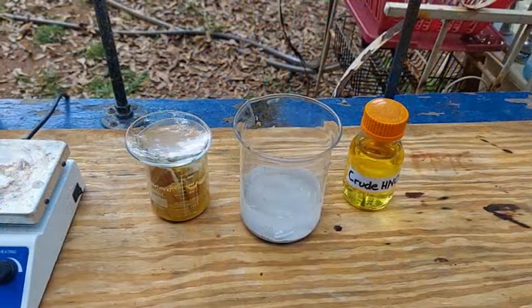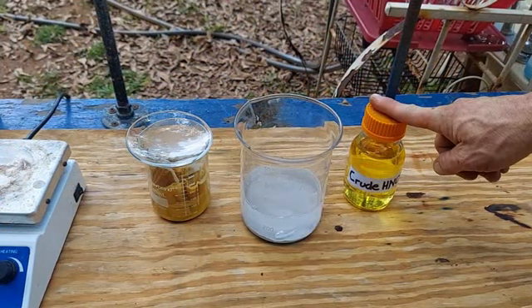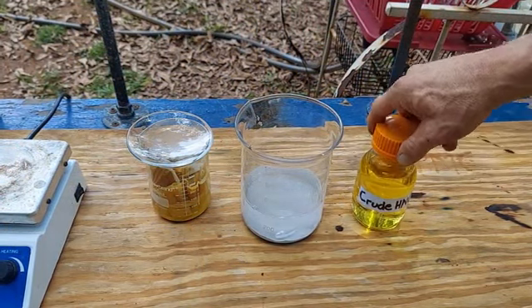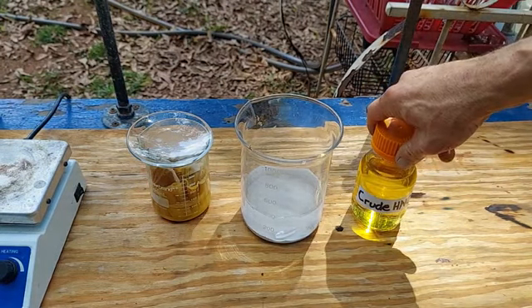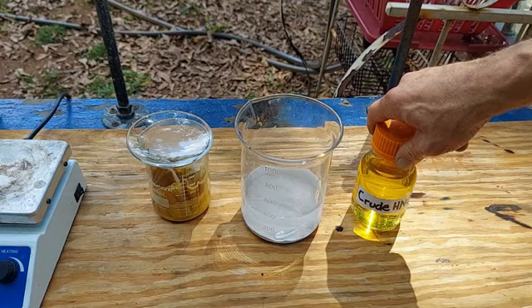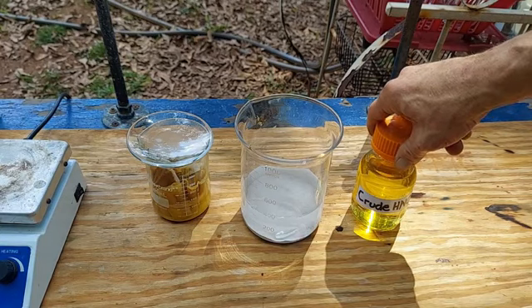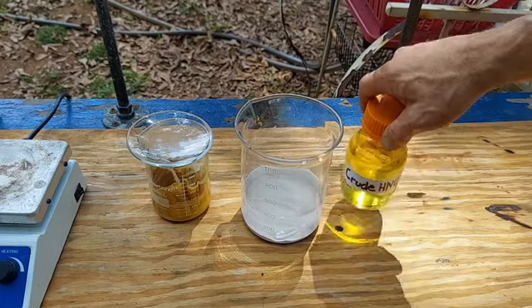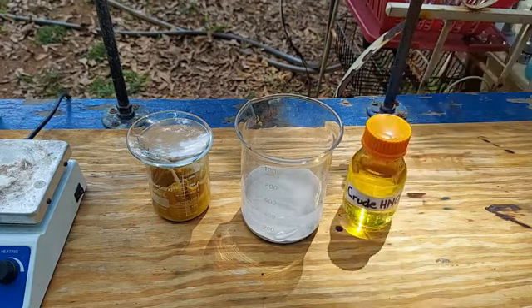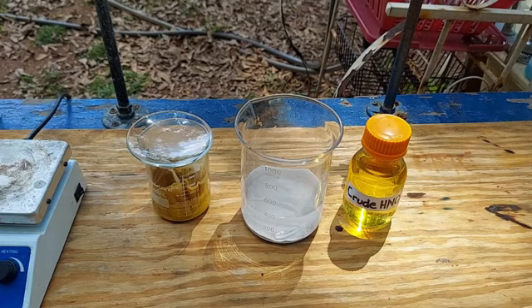Okay, so this stuff has been sitting around for several days. I spent yesterday making up some more nitric acid. It says crude because I just distilled it once. I haven't fractionally distilled it or processed it in any way. I don't know that we'll need to. Of course, it's kind of a golden yellow because there's nitrogen dioxide dissolved in it. Normally I would redistill it to get nice, clean, azeotropic white nitric acid, but again, I don't really think that we need it here.